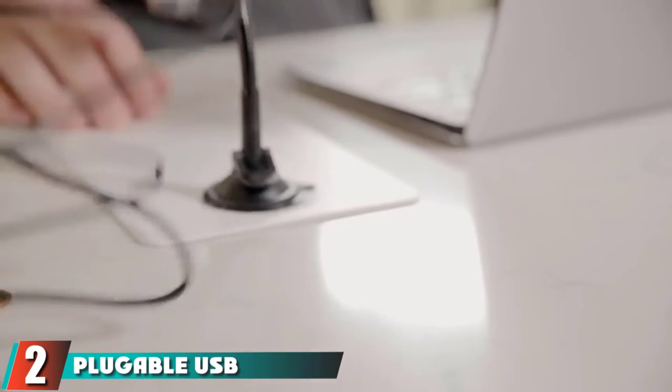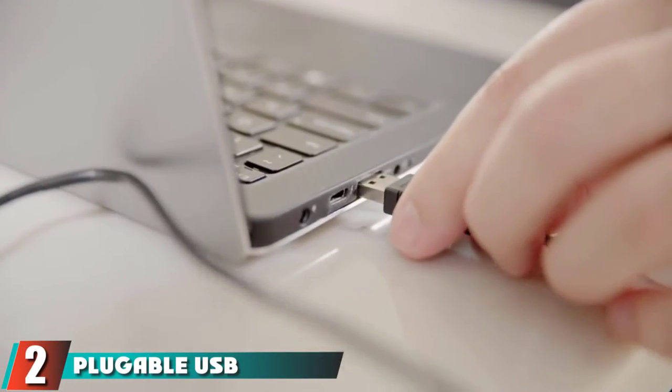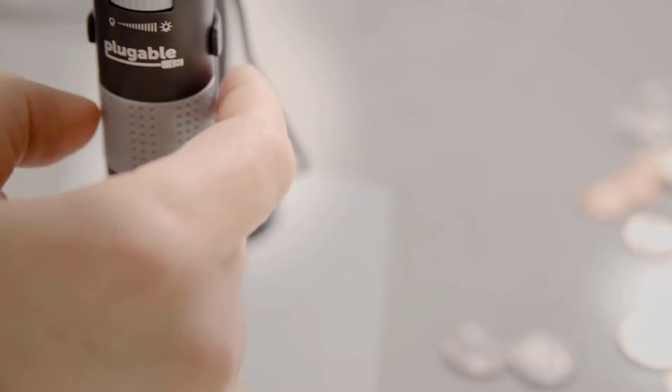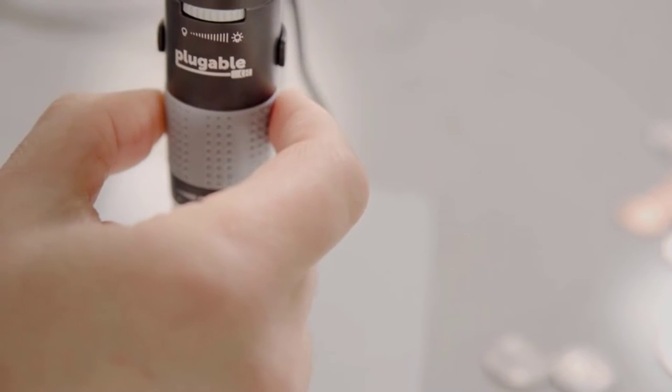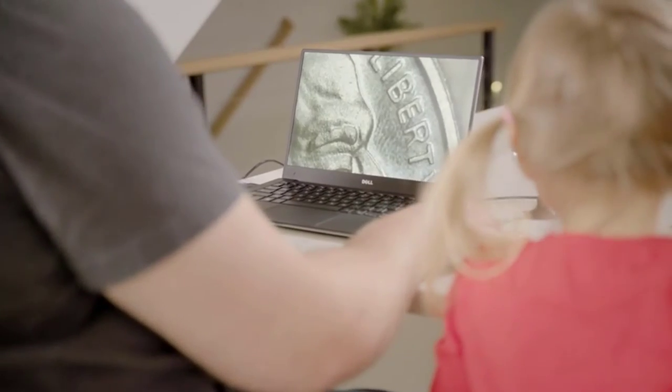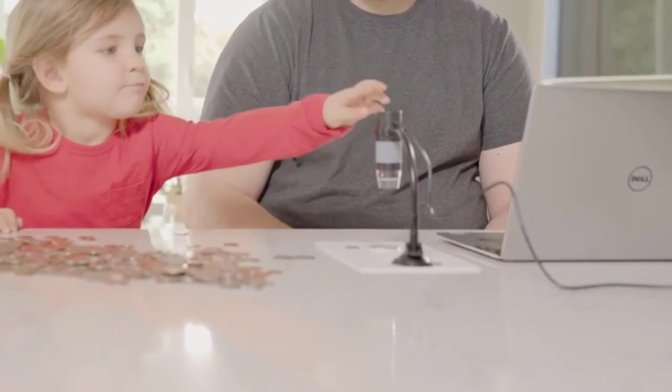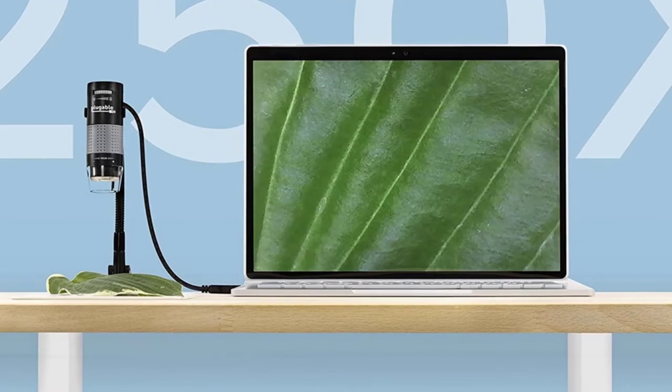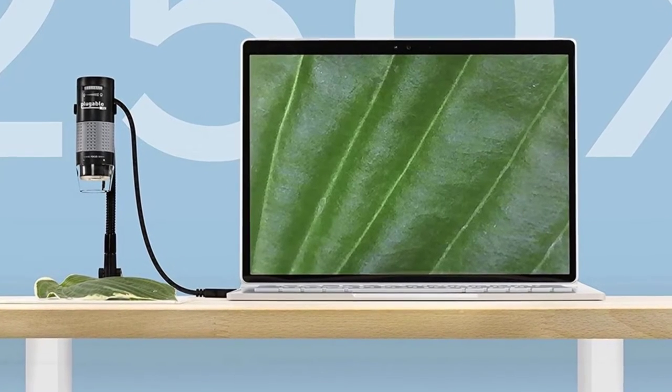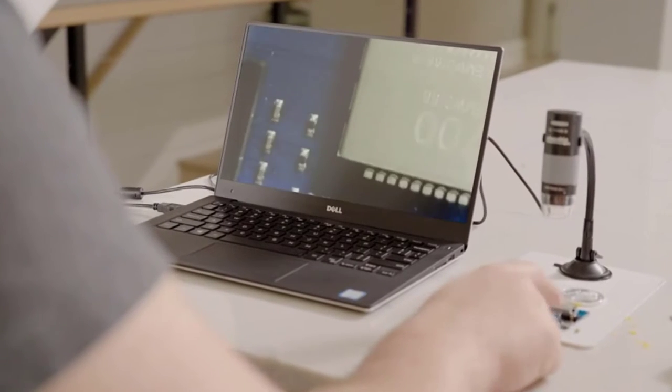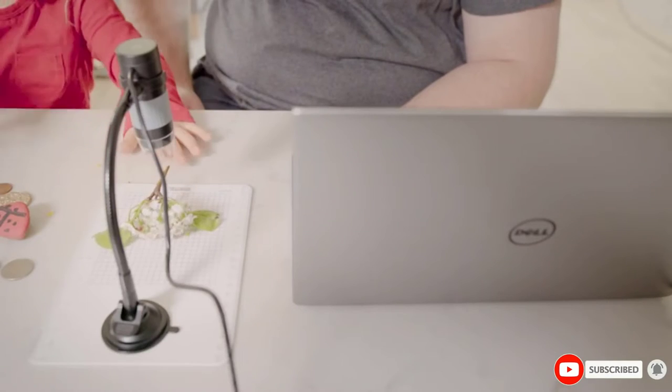Moving on to the next at number two with Plugable USB Digital Microscope. This is the best digital microscope for people on a budget. It doubles as a camera where users can see the mounted sample on an external monitor. If you're a teacher that handles a bunch of pupils in the classroom, this is the best microscope for kids to get. The device is easy to use. Simply plug it in, and you're ready to go. It has a four-foot-long cable with a USB 2.0 at the tip. The webcam chipset is configured to work on any operating system. With a maximum magnification of 250x, it is powerful for your child's continuous open-ended fun.